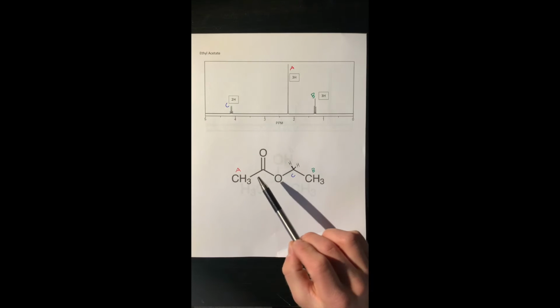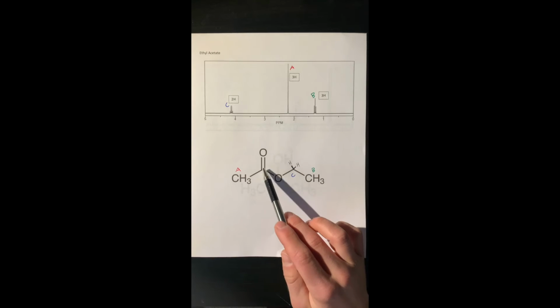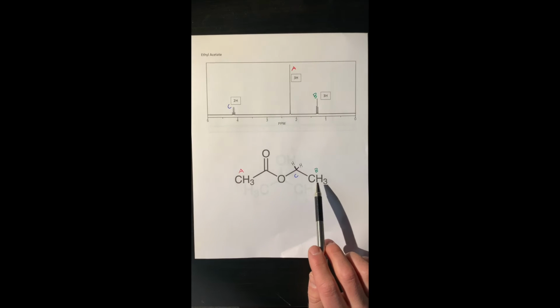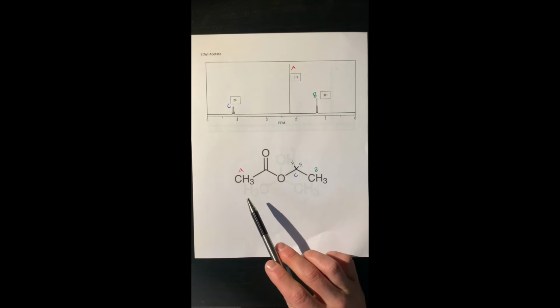This peak is between the quartet and triplet because it's closer to these electronegative oxygens in the ester than this one over here. So this one is the furthest away from the oxygens, and this one is in the middle. This is the closest, so that's why the signal is in the middle.